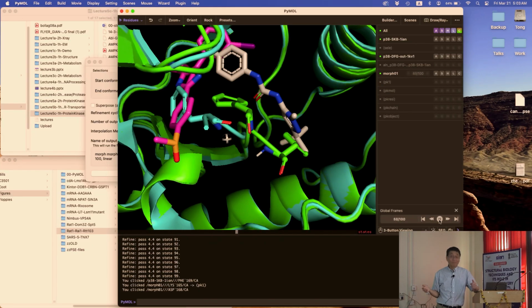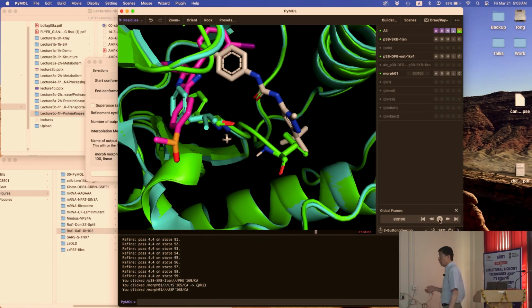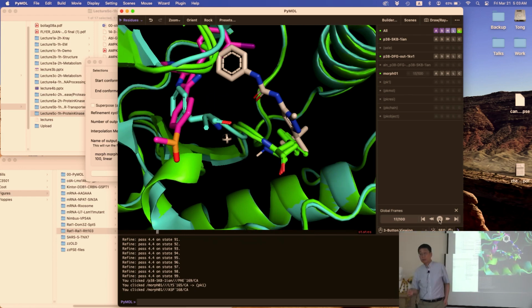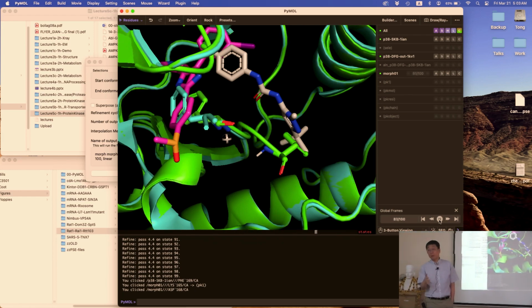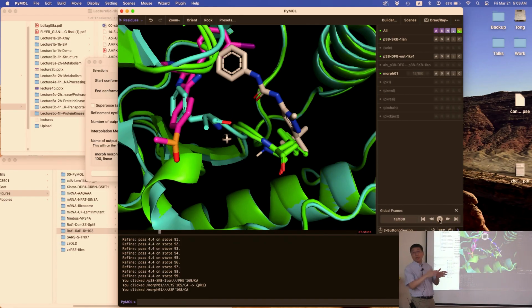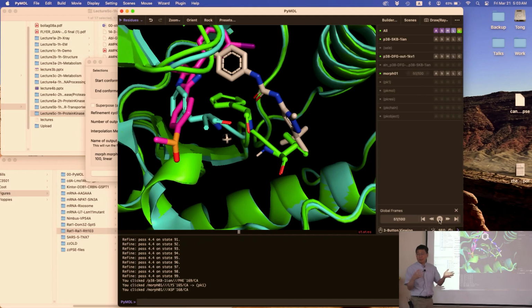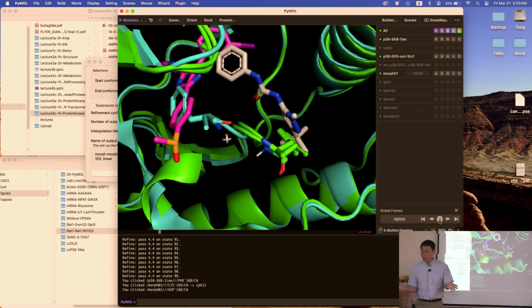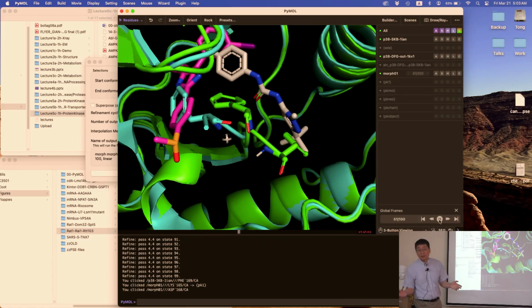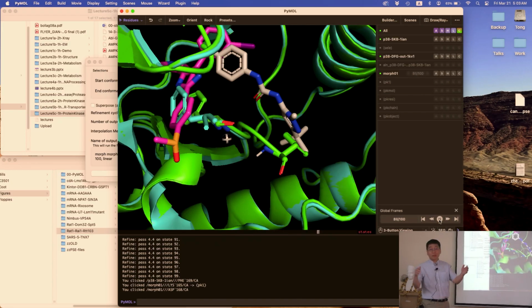Yes? Huh? What? Please repeat this. Uh-huh, from the side chains. Yeah, showing the side chain is more informative, right? You can also show the aspartate ahead of it, the DFG, the DF, but then that'll get a little bit more complicated. So you have to make a compromise between getting it across versus showing all the information you want. Sometimes it's more important to make sure that people understand what you're trying to say than tell them the entire story.